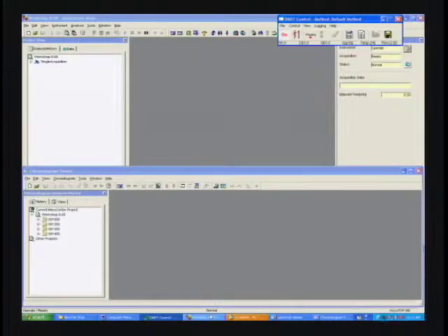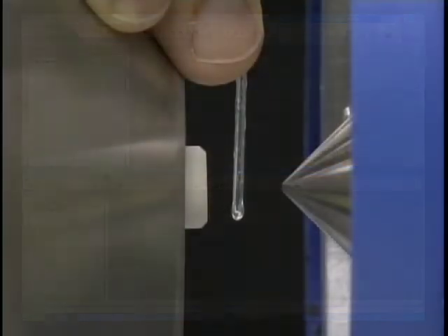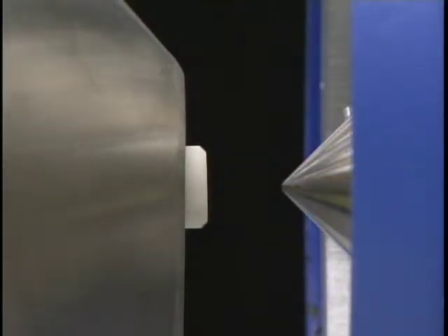Oh, sure. You won't see any signal while I'm doing that, but at least you can see me. Yeah, just for action. Well, actually, I guess I can. Okay. So just like that.